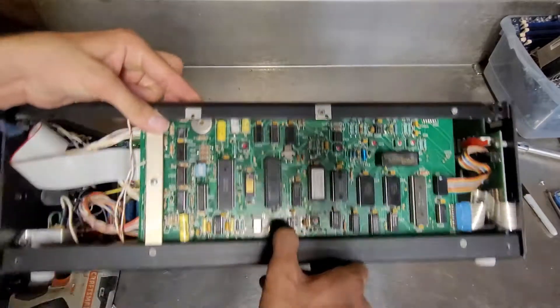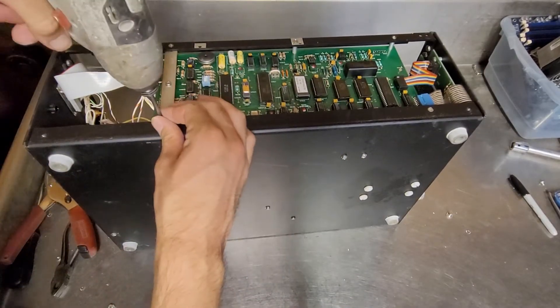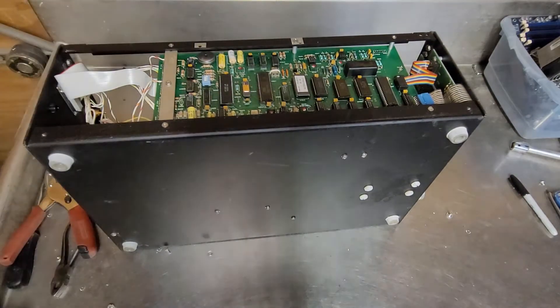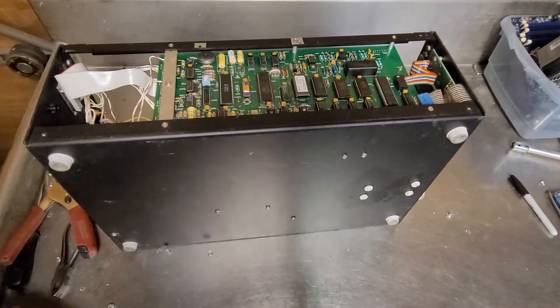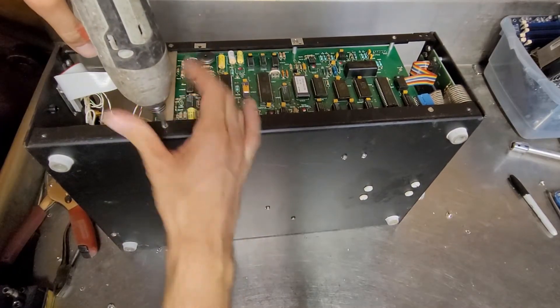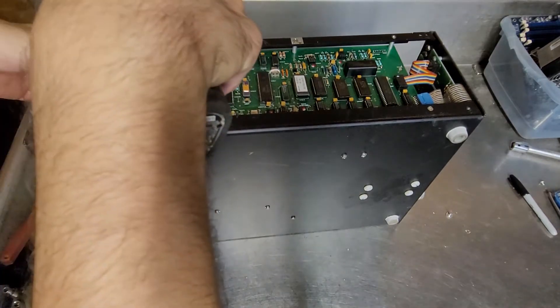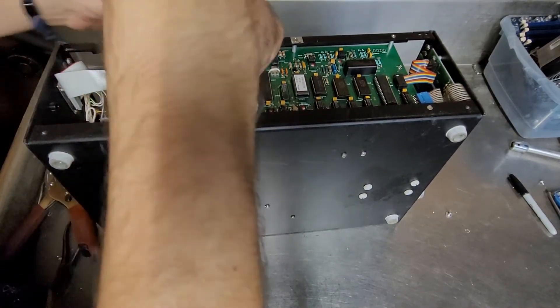I guess I'm going to start on this side. I need my number two Phillips, which I think I might have misplaced. I think I broke that loose. There's just so much going on in here.